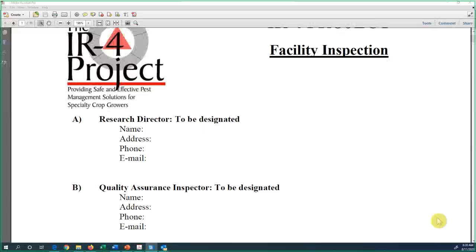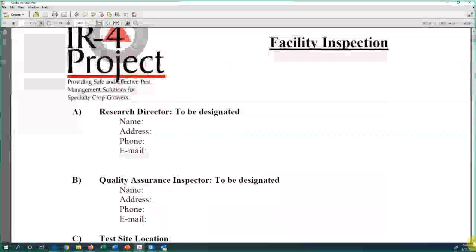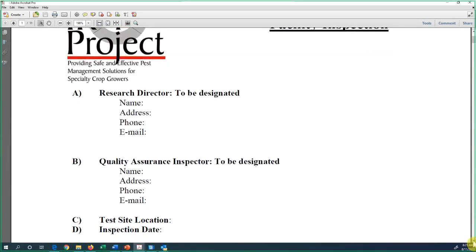So it depends on the situation. Talk to the study director. Make sure this is okay if your method does not allow you. That's considered a sort of major change. So it depends. Talk to the study director.